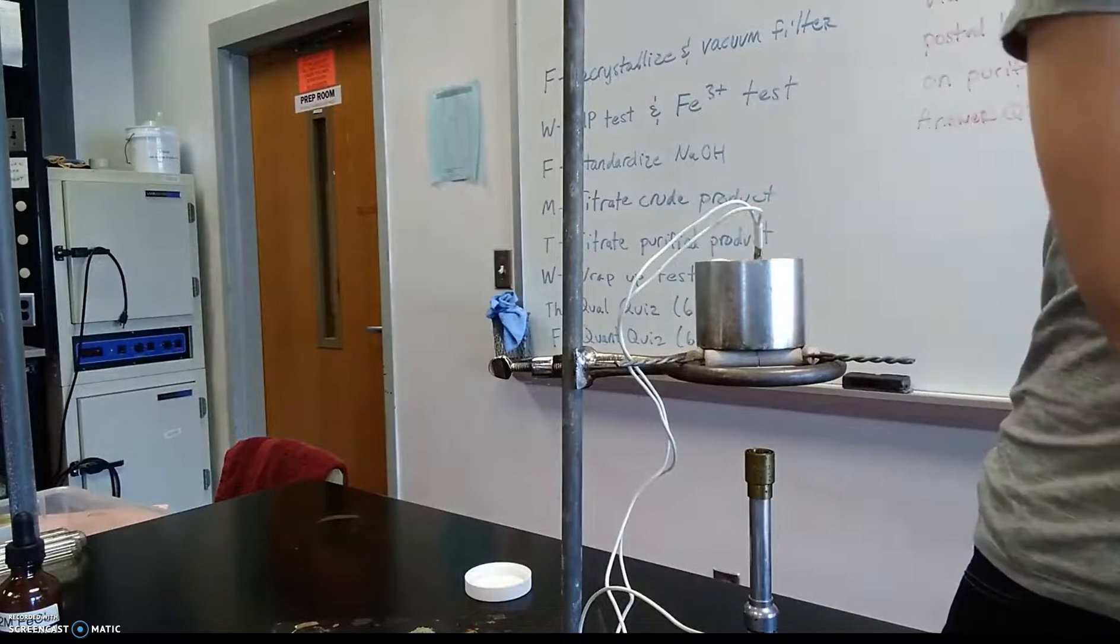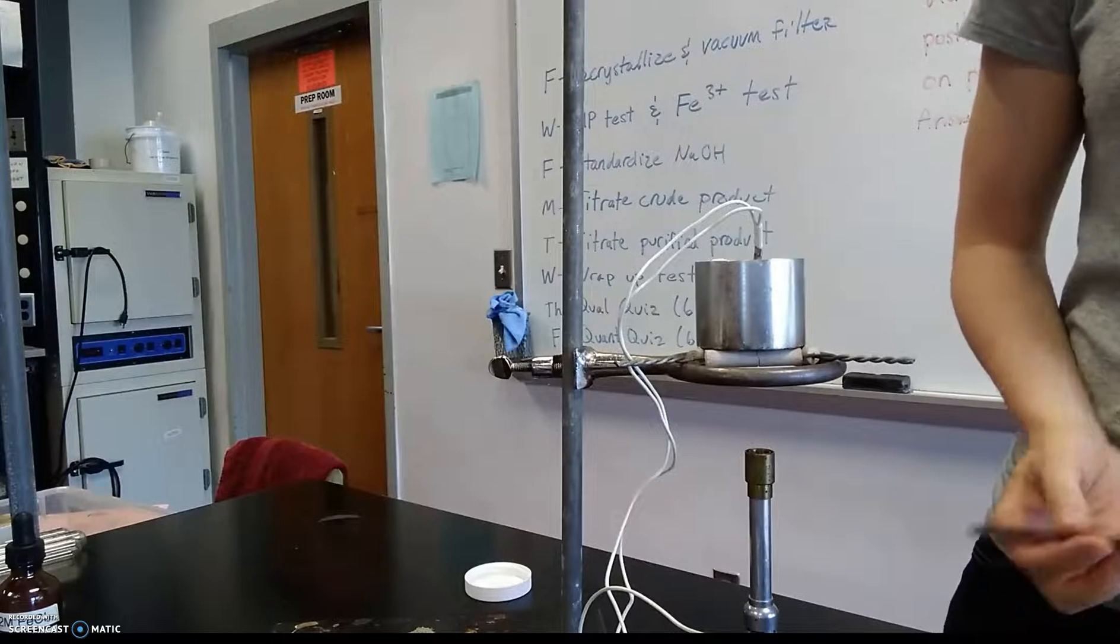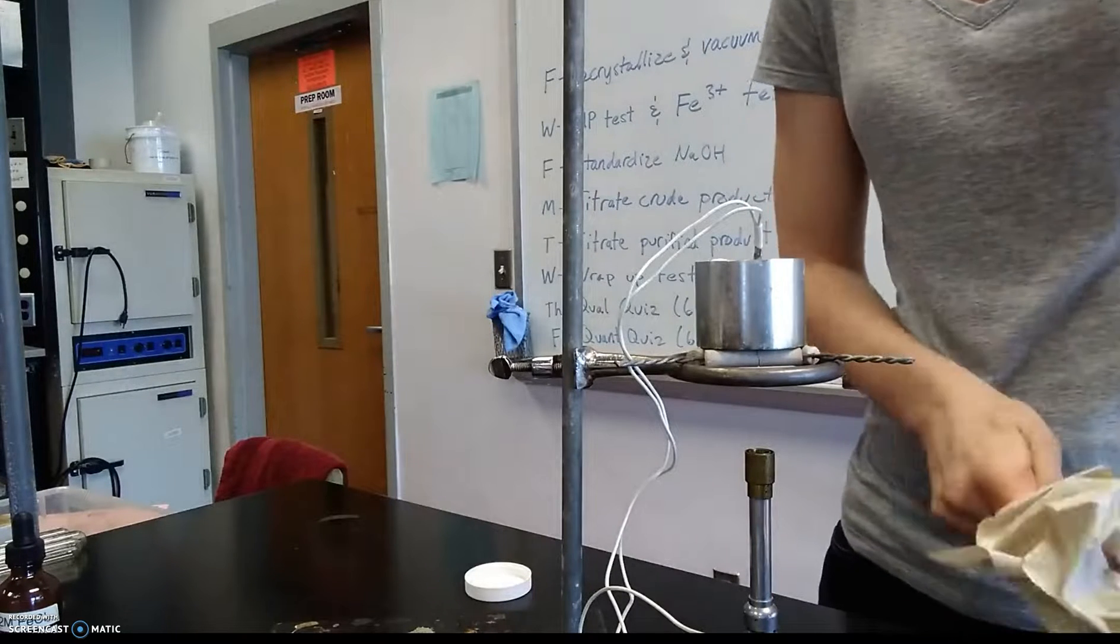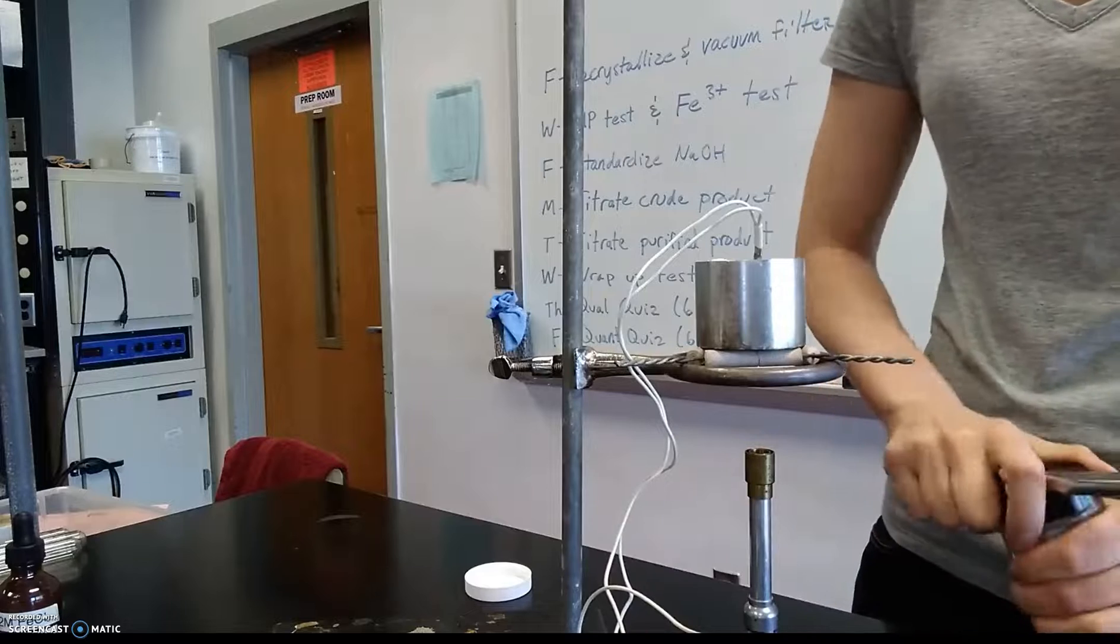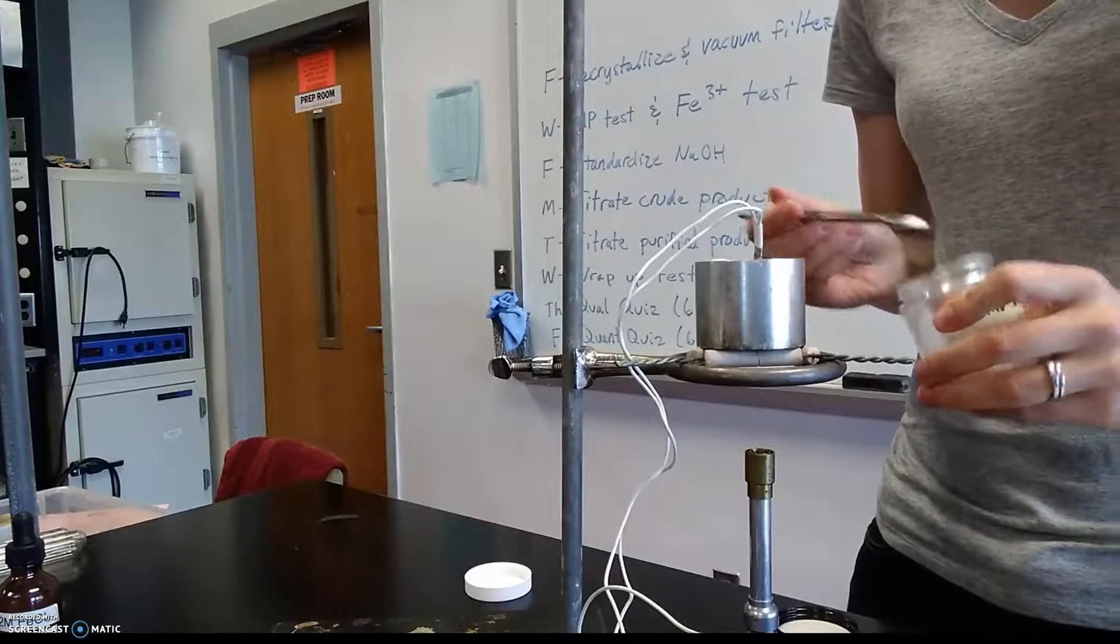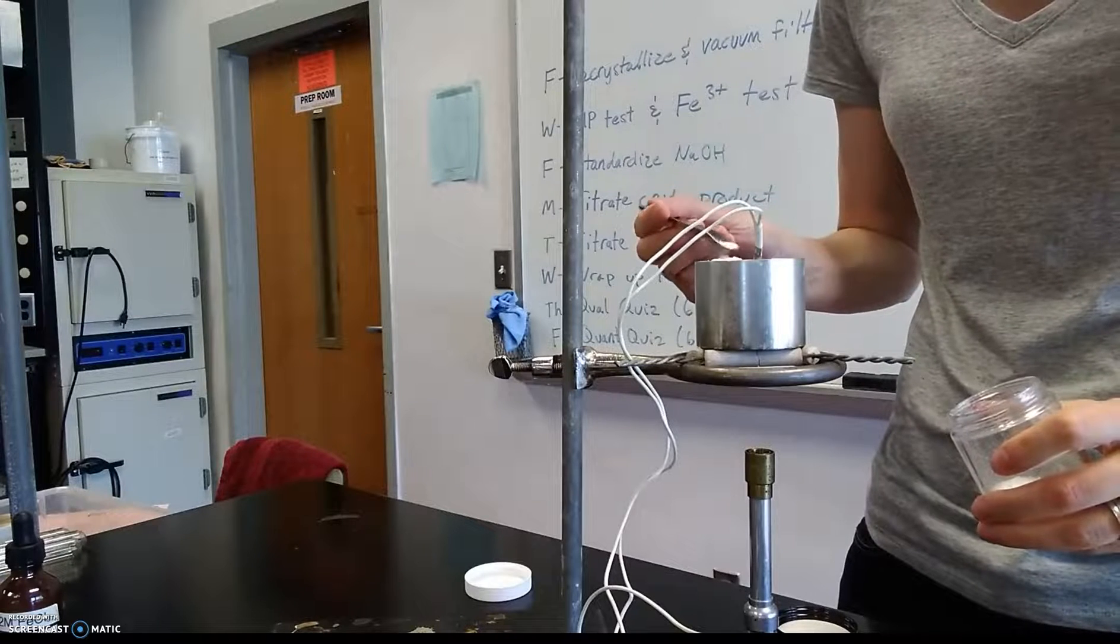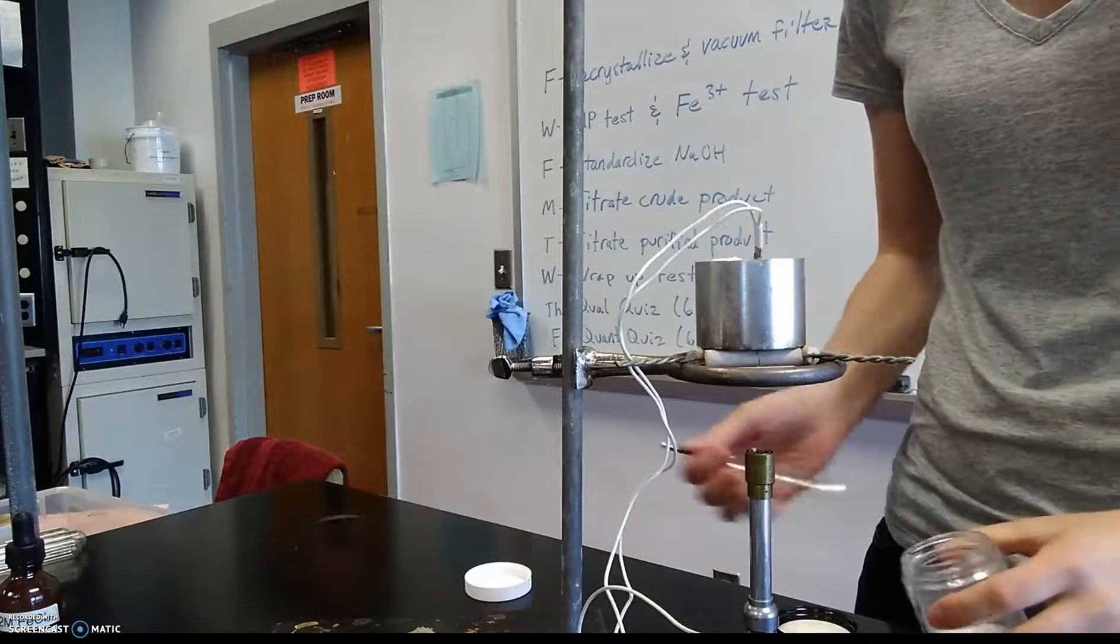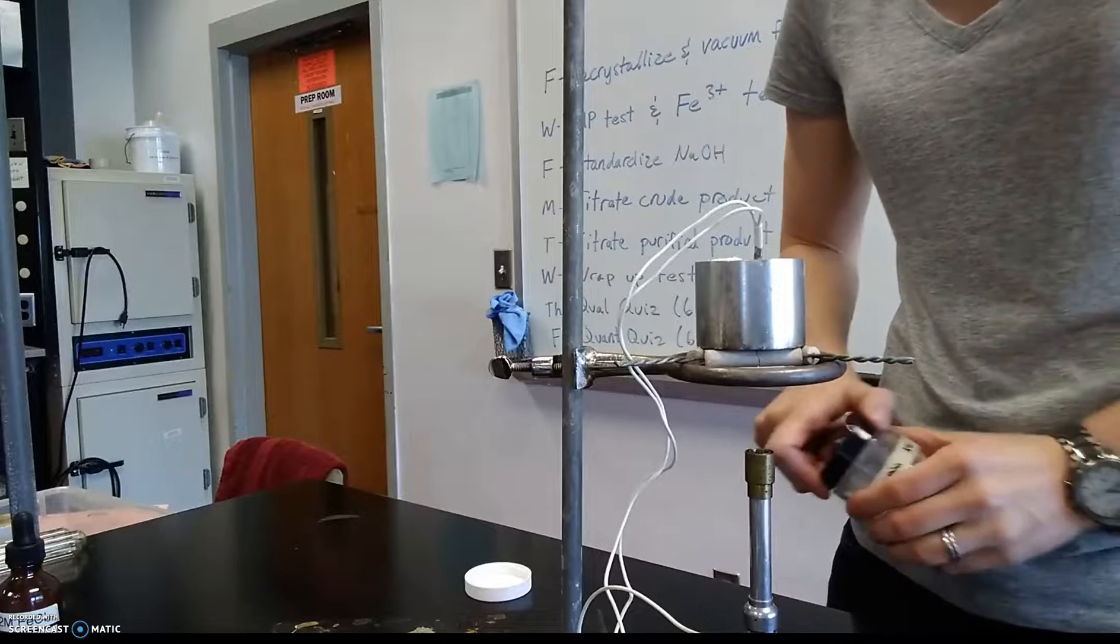Get that on there. Again probably more than I need. I'll discard the remainder. And I'm going to test all three samples at the same time. We're not going to have time in class to heat this up and cool this down more than once. So I'll have my in this case purified sample. Put a little bit on there. Again don't overdo it. Don't use a ton of your sample for these tests. You're going to need it for a titration.